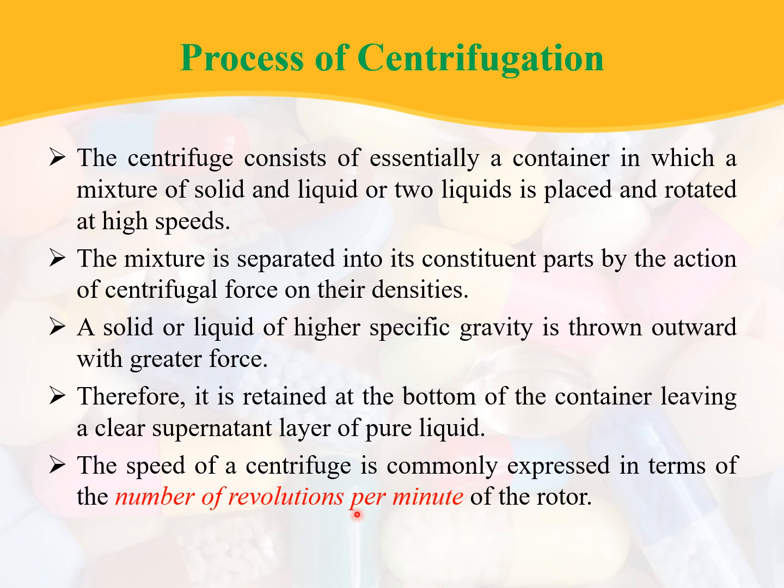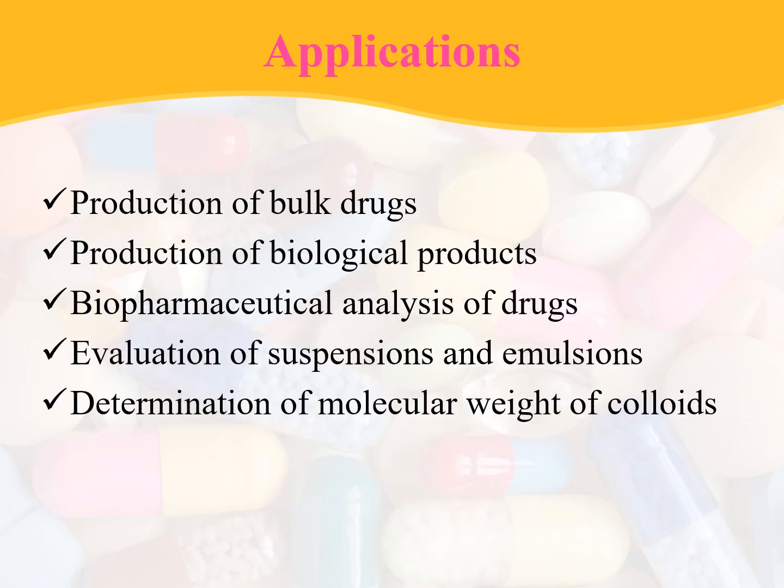The speed of the centrifuge is commonly expressed in terms of number of revolutions per minute of the rotor. This is important. The centrifugation process has multiple applications in the production of bulk drugs, biological products, biopharmaceutical analysis of drugs, evaluation of suspensions and emulsions, and the determination of molecular weight of colloids. These are some of the applications of centrifugation in the pharma industry.